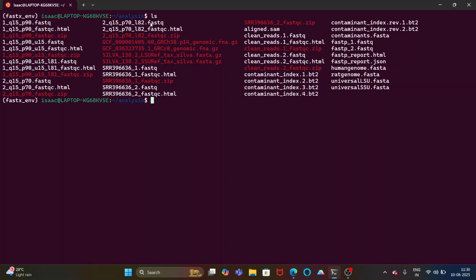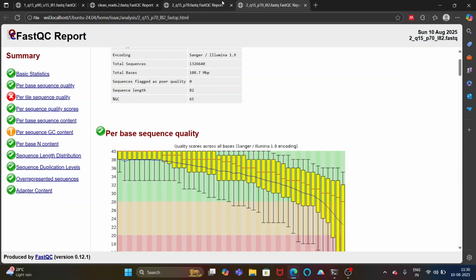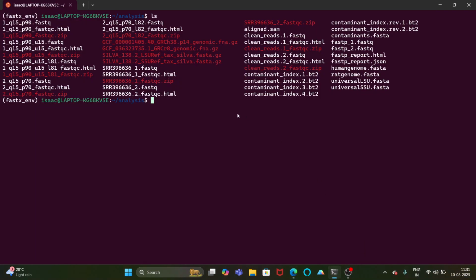We will use these two files to do a sequence assembly. But before that, most of the tools that are used for sequence assembly in bacteria, like BWA and SAMtools, suggest that both of the files, the forward read file and the reverse read file, should have the same number of reads. It is required for maintaining proper alignment. So what I will do is use the tool fastq pair.